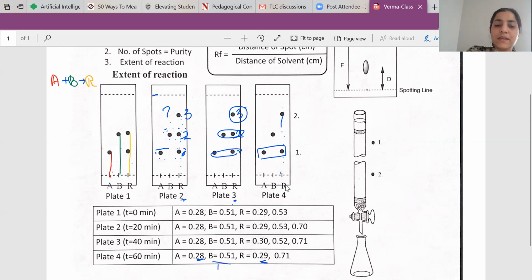The compound B is no more present in the TLC plate. You have a second spot, which is a newer spot. It did not match A, it did not match B. It is a new spot, which is probably the product of the reaction mixture.